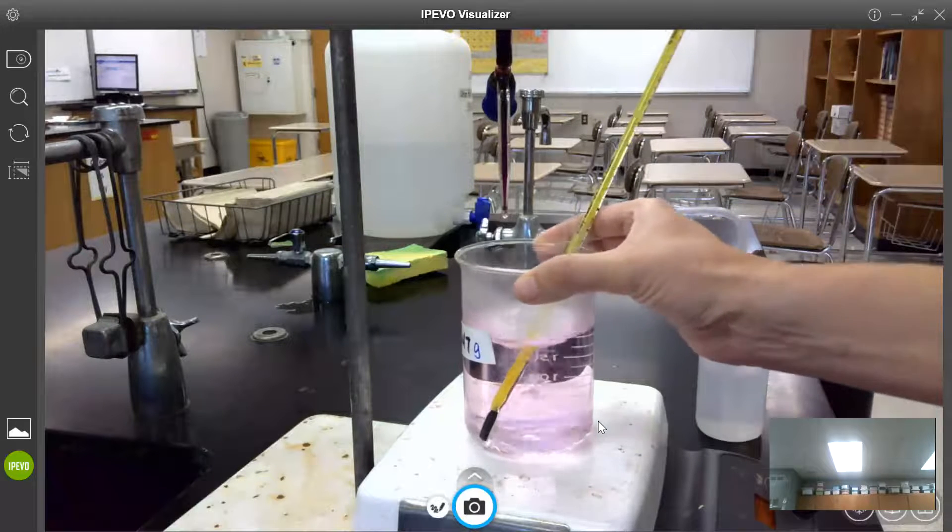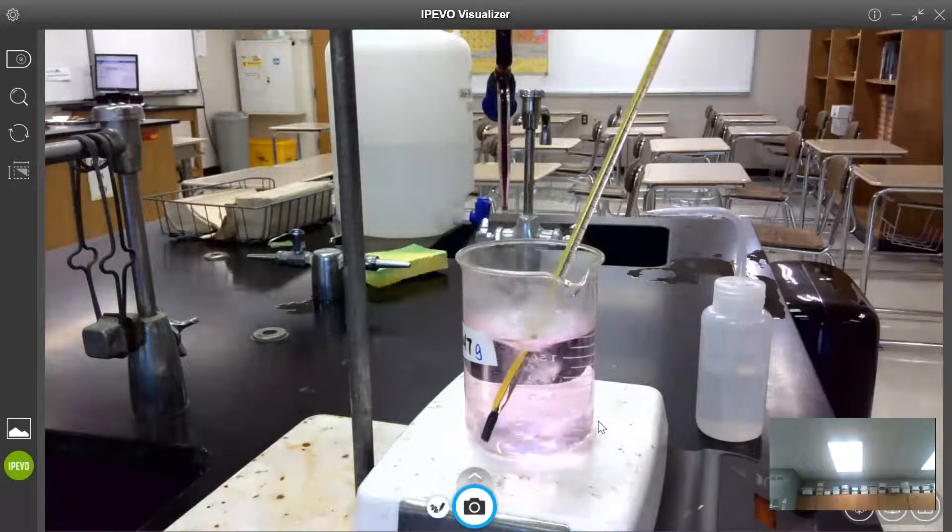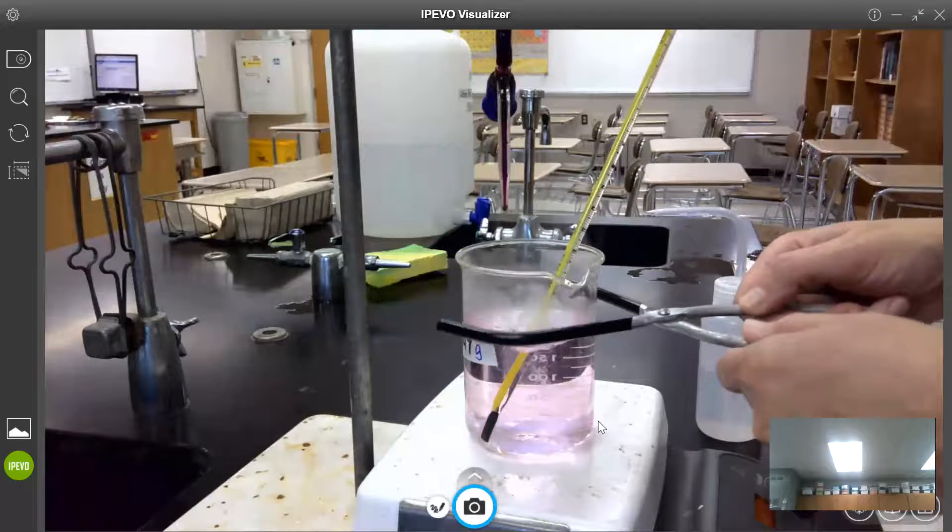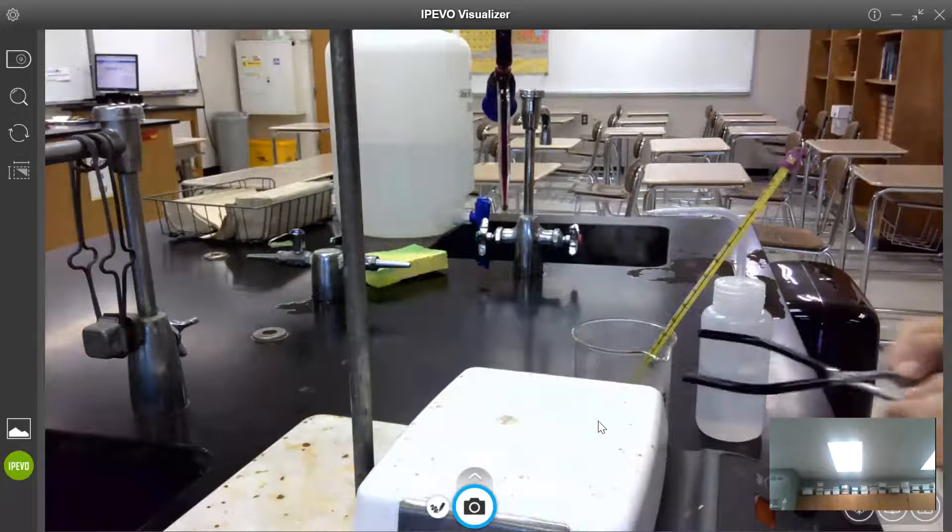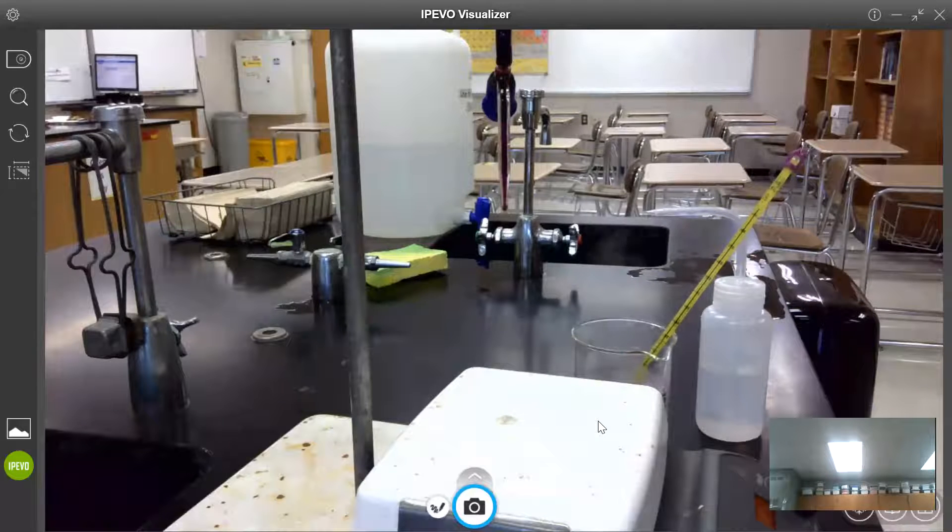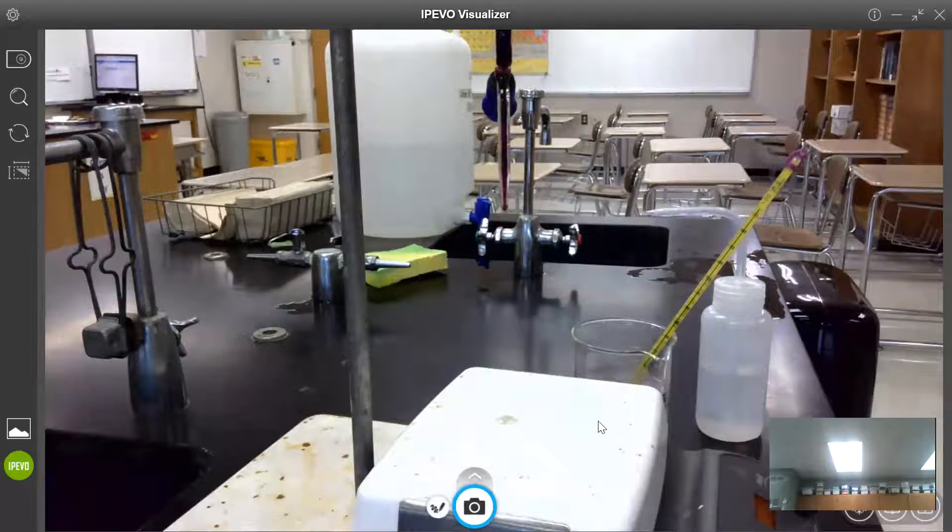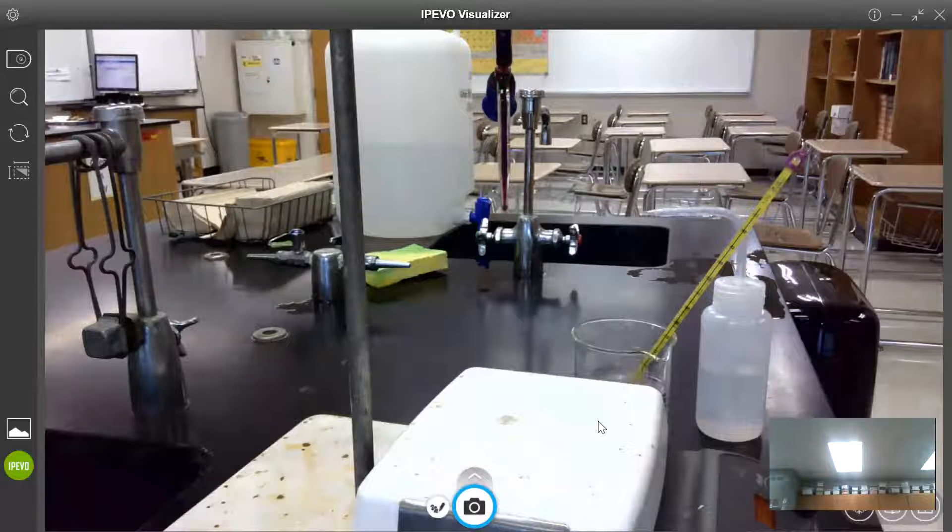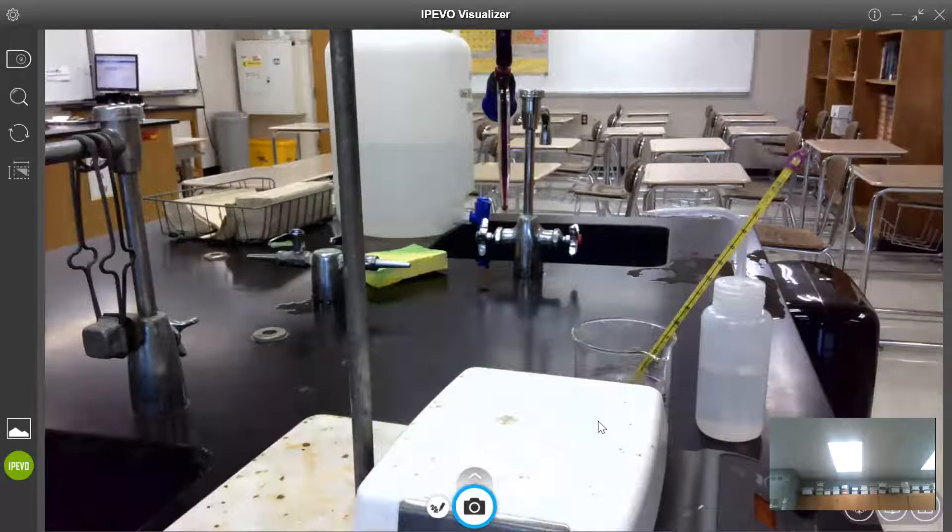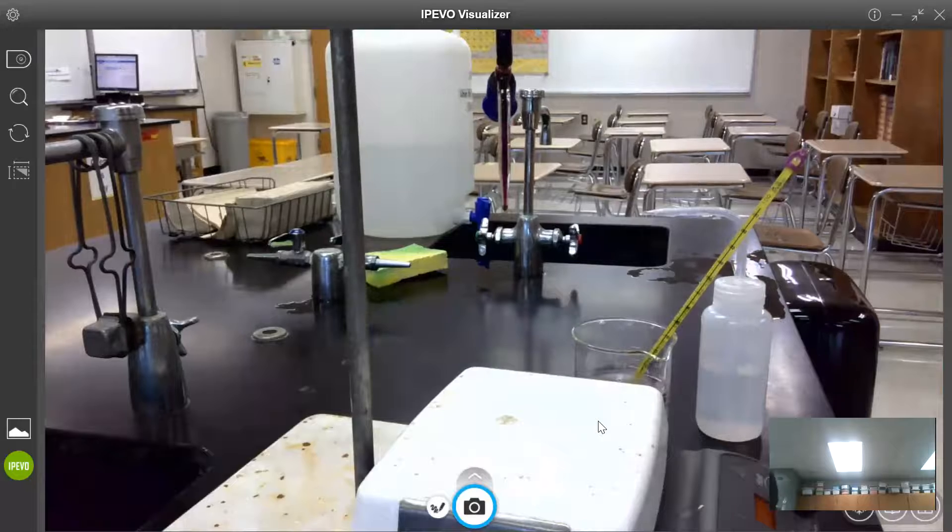I'm going to just remove this from the heat. Actually, I'm going to use some beaker tongs to do that. And I'm going to record the final volume on the burette, which is 44.55 milliliters.